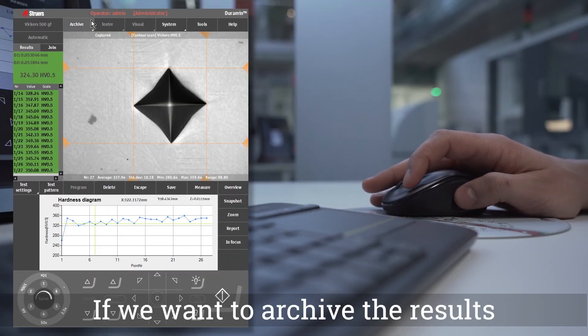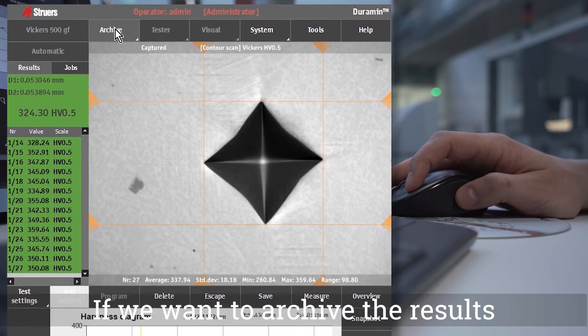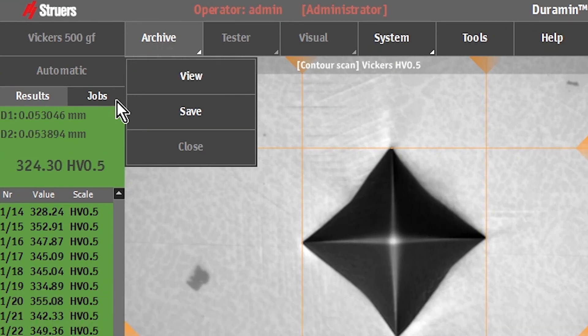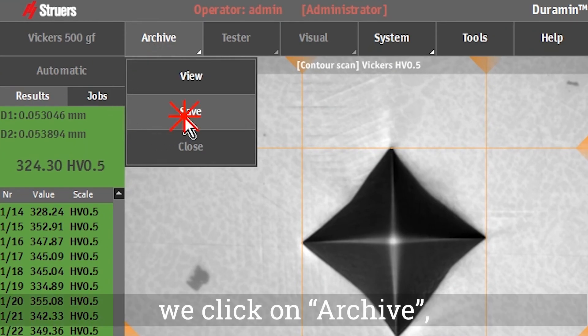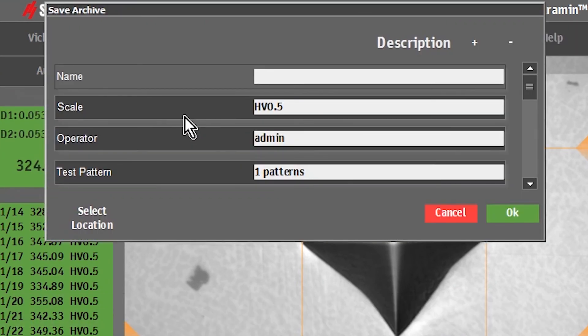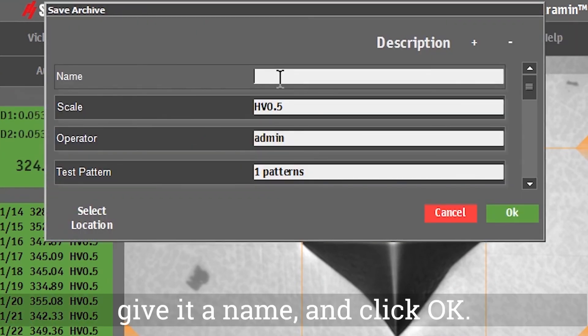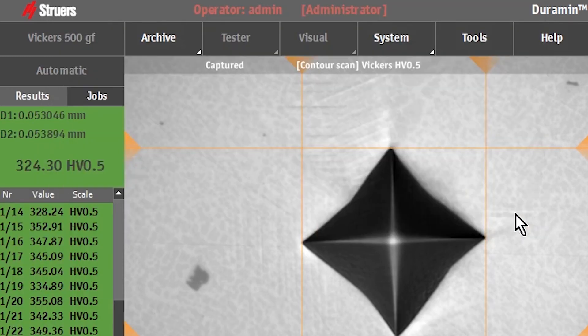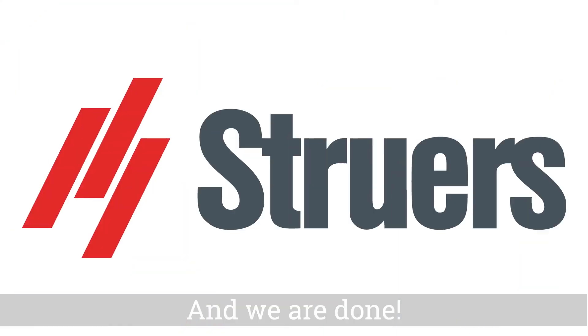If we want to archive the results inside the software, we click on archive, give it a name, and click OK. And we're done!